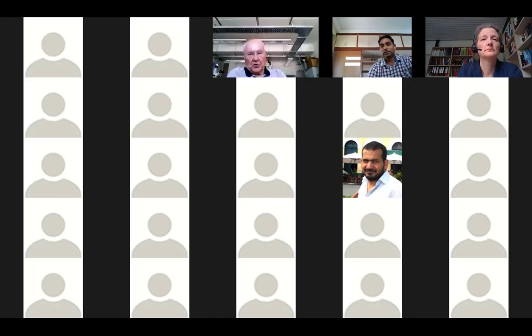The reflectors are perfect. They are really super clean, the quartz reflectors, and also from flatness it was a big advantage. So the background goes down also for this reason, because of the surface quality of the reflectors.